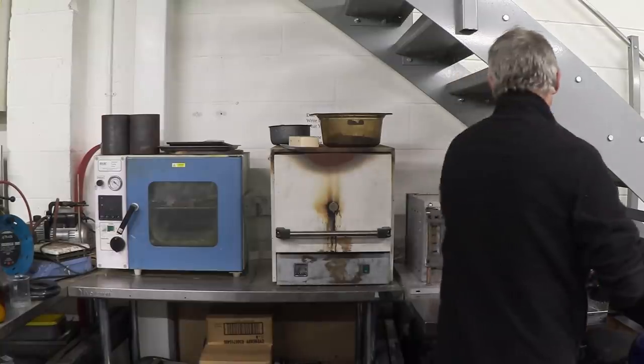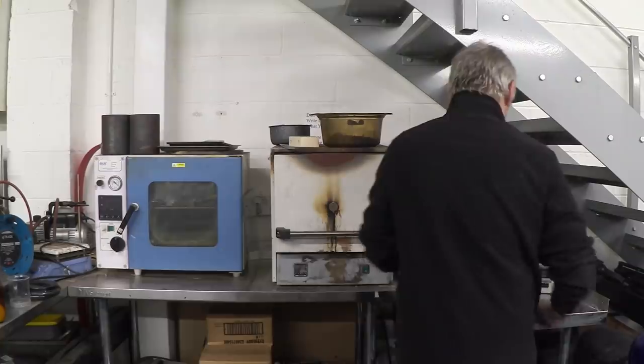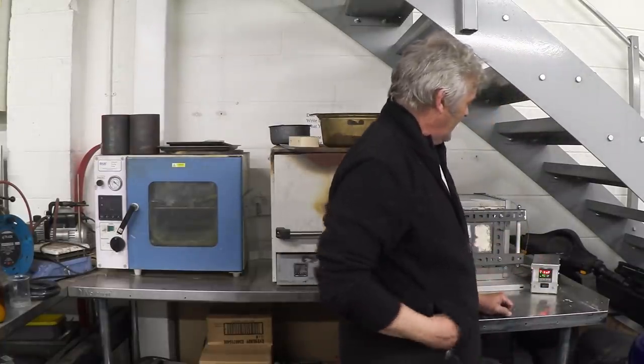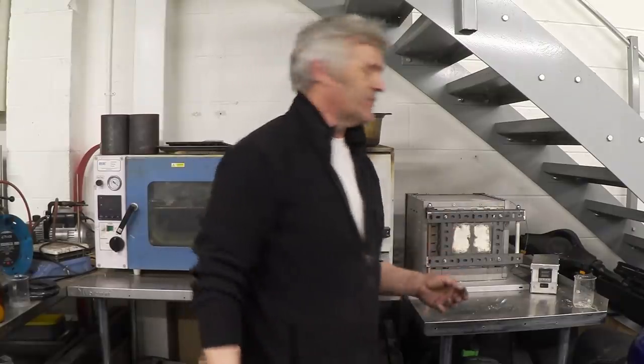Then leave it for three hours, flip it off, and come back to it when the whole thing's cooled down. So all we're going to do is put this in here, close it, turn that on, and that will begin to cook. We'll get back to it three hours from now.